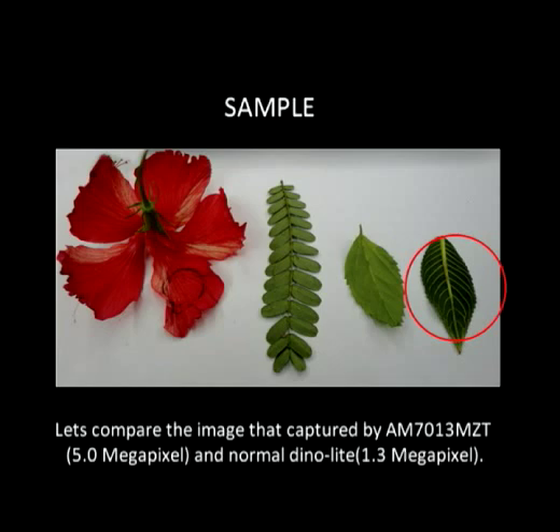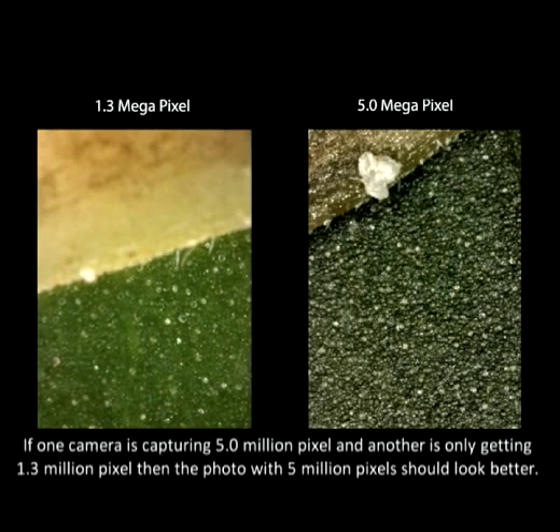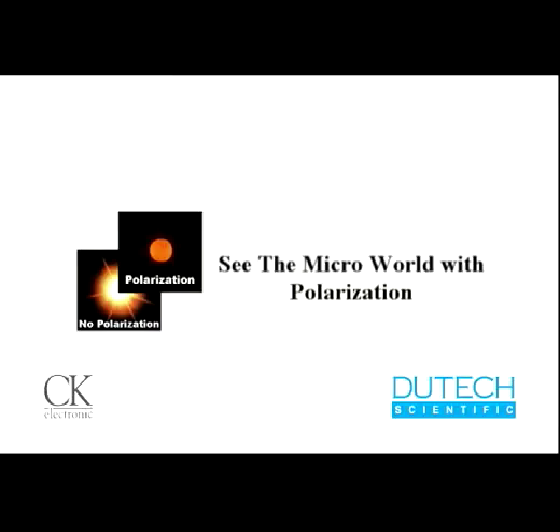Let's compare the images captured by the AM7013MZT and a normal DinoLite. If one camera is capturing 5 million pixels and another is only getting 1.3 million pixels, then the photo with 5 million pixels should look better. See the micro world with polarization.